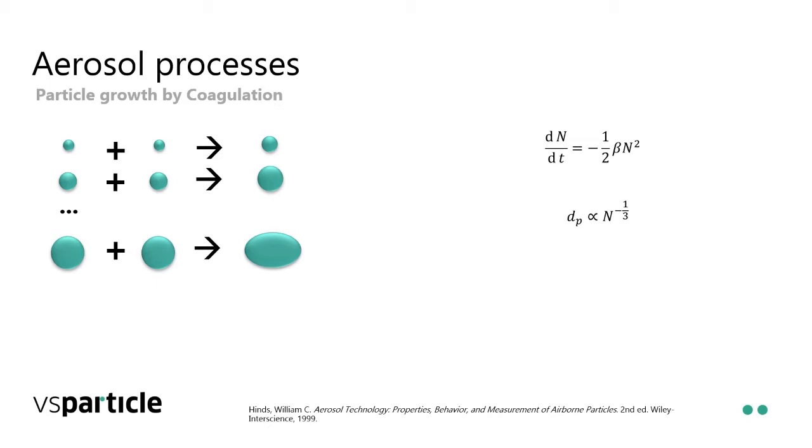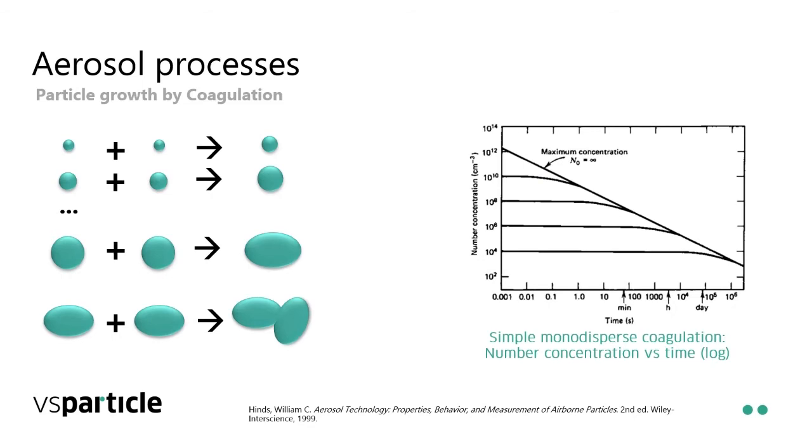And so you can get weird shapes, and that keeps going until you start getting fractal agglomerates. There will be a TEM image a bit later on that describes it in better detail. But that shows also how you can quickly get particles that very much are not spherical, that can have relatively small primary particle sizes, so these individual units, but together as a bigger particle, they behave as a somewhat bigger particle.